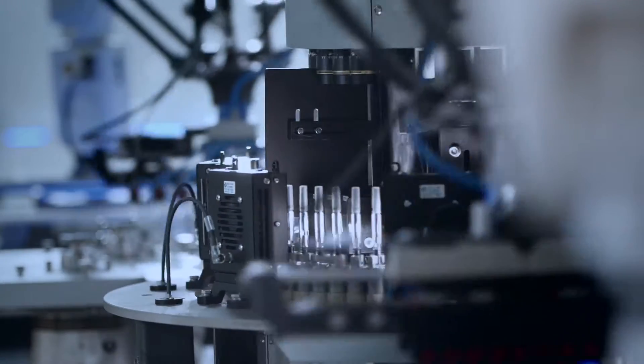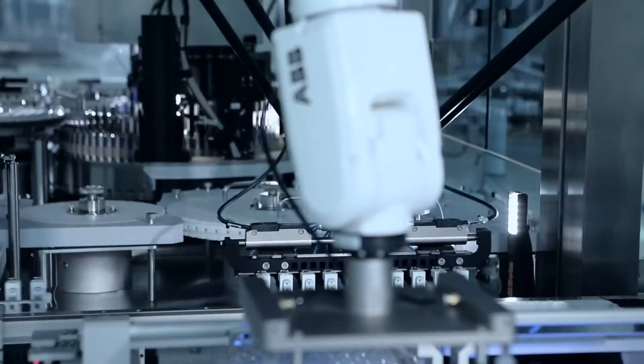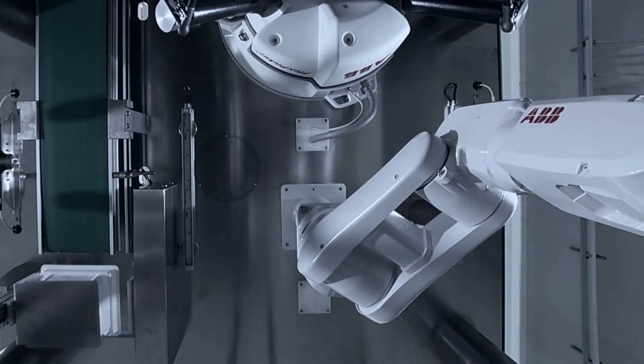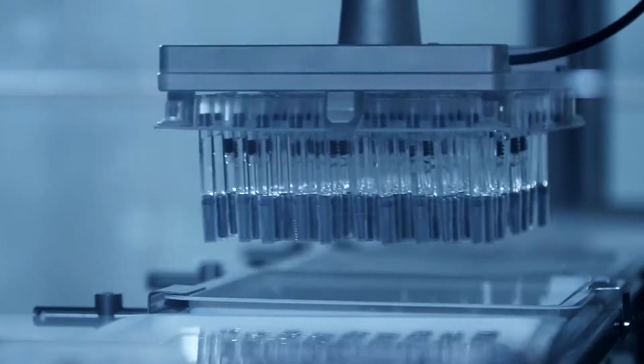The machine operates at the extraordinary speed of 600 pieces per minute, with both glass and plastic syringes filled with any type of liquid, viscous or gel products.